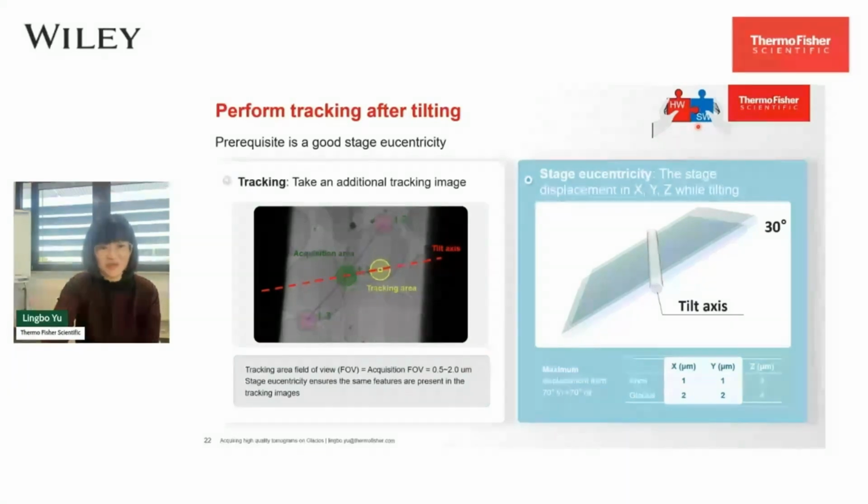And here I want to emphasize that this is a good example of hardware and software working together as a system. We need to tweak our hardware, but hardware is never perfect, especially when we're talking about nanometer accuracy. We need the software to fix the remainder. But software can only fix a certain amount. Hardware still needs to be good to start with.